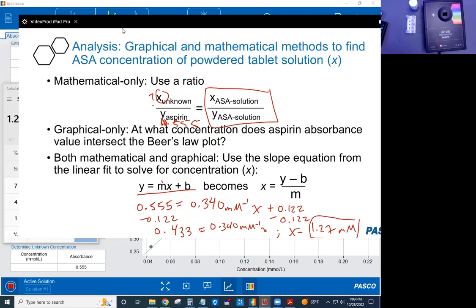Oh, it was 3.4. Yes, I had missed a decimal place. There we go. And then that would be 0.127. I thought that was a bit high. So pardon me, 0.127 millimolars was the actual concentration. My mistake. And this is good. You know, students might make a mistake.